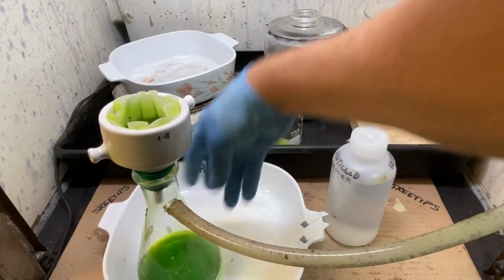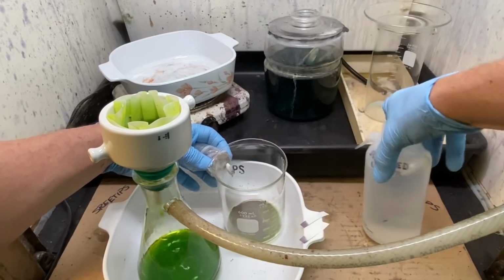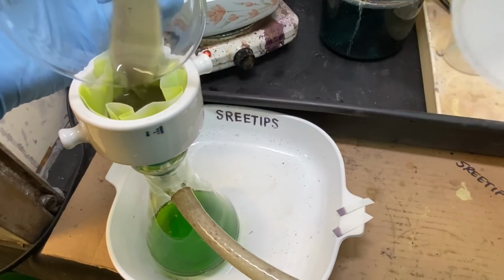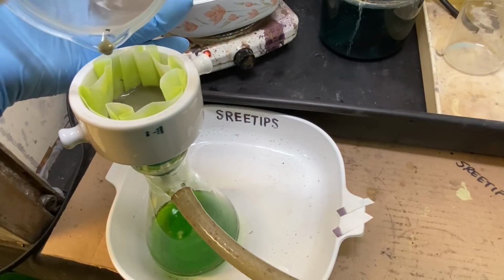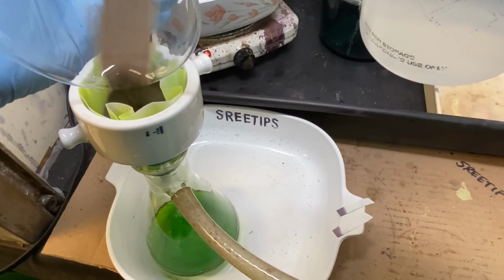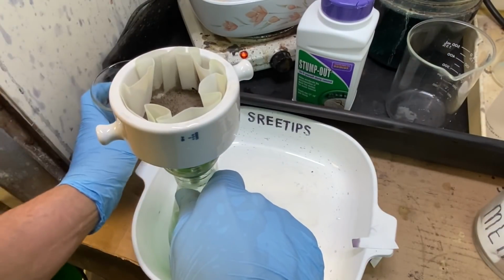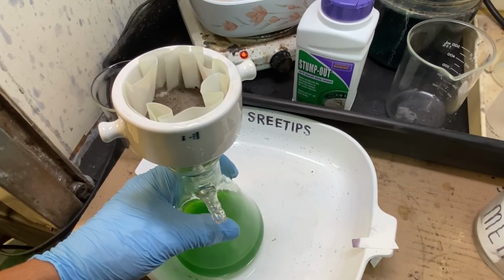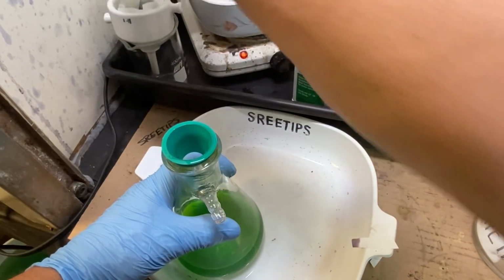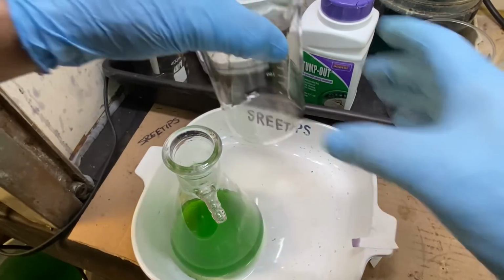This magnet out of here. It's got a magnet in a bag there. Pull the magnetic stir bar up out of there. Okay, this looks like it went pretty well. Get all this junk in here into the filter. I'll save those solids, put this in my paper storage. Transfer this solution into a clean beaker and go for precipitation.